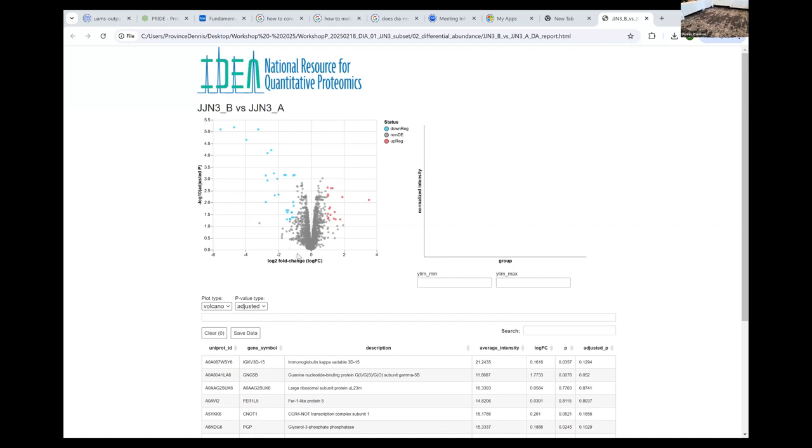So there's your volcano plot here, and I just want to go through it. First of all, remember we talked about in your contrasts what the title of this was. This is where you have declared that we are taking group B and subtracting from it the values of group A, because all of the quantitation that we do in our global proteomics is relative. What Mike is going to talk about in the targeting section is absolute quantification, where he can tell you concentrations. We can tell you that this value is so many fold changes above this other value here.